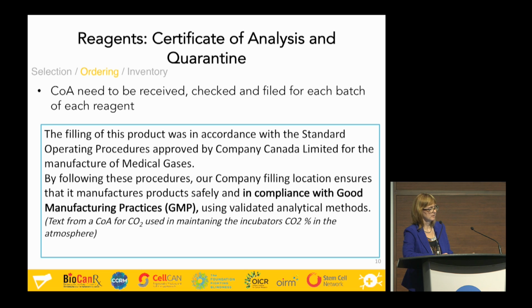The text is an example of the certificate of analysis of the CO2 that we use in the incubators to grow our cells. And the company states that it's done in compliance with good manufacturing practice itself, and they are using a validated analytical method to fill in their certificate.